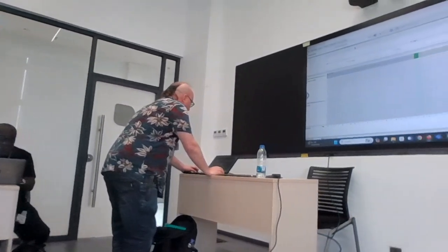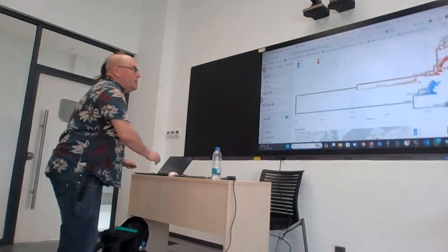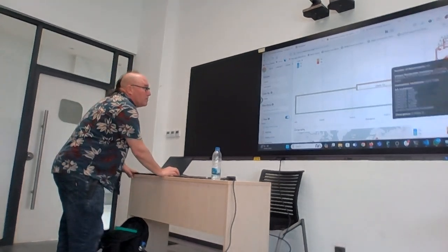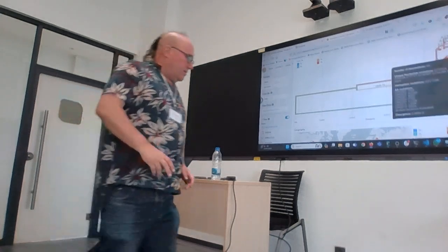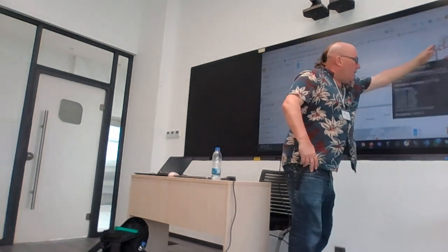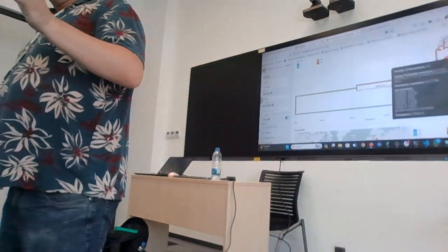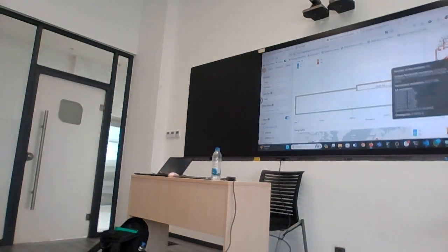So for instance, when I look at Nextclade, if I click on one of the branches here, then it tells me which mutations are first seen in this branch, okay? That was seen in the branch, and then all the descendants. When we discuss phylogenetics, we can discuss this in more detail, but my point is, just because you see a variant doesn't mean that the variant is new. It's just a variant relative to the reference. You always have to understand this.